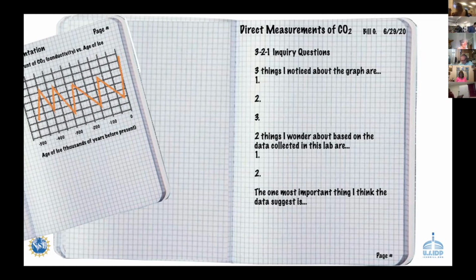You do have to be careful, like I said, Perrier is just full of minerals. I mean, it's so high of conductivity, it blows these meters off the chart. So you do have to play a little bit with what seltzer water you're going to use to make it. But yeah, yours is going to be opposite because you didn't have deionized water. So, good question.